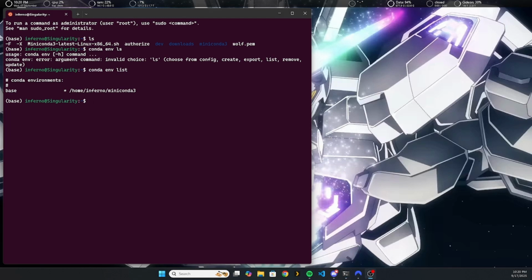Essentially, when making a conda environment, realistically, what I like to do is each one of my scripts or modules or any sort of analysis I'm doing, I try to make a different environment to avoid any sort of conflicts. So for instance, in this one, we can just do, let's say, some basic Python.